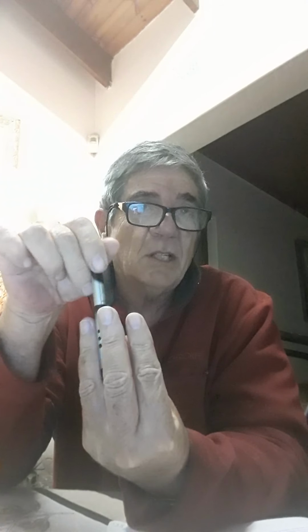These reactions can be determined by inoculating. So when the test tube is sterile with the glucose, we take our inoculation loop and inoculate this broth. That's the process of inoculating: when we inoculate the sterile medium with the bacteria. These reactions can be determined by inoculating into carbohydrate broth containing the Durham tube. The medium consists essentially of a nutrient broth plus 0.5% of the different types of sugars, either glucose, sucrose, lactose, melibiose. There are hundreds of them.